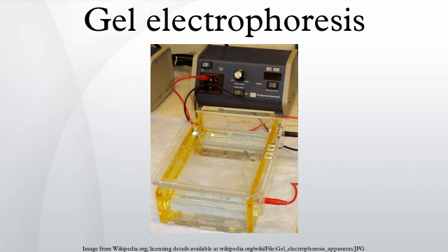For proteins, since they remain in the native state, they may be visualized not only by general protein staining reagents but also by specific enzyme-linked staining. Native gel electrophoresis is typically used in proteomics and metabolomics. However, native PAGE is also used to scan genes for unknown mutations as in single-strand conformation polymorphism.